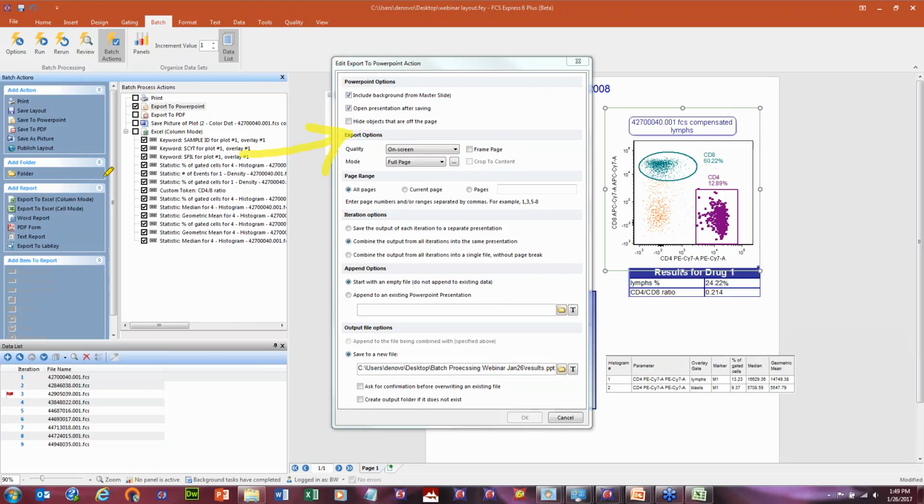And that'll sort of compress the results for you visually, help you save paper, whatever you're trying to do. All right. So the tiling options are here under export options. So before I actually run the tiling options, let me explain to you the options that are available to you. So under mode, there's this drop-down menu. And like I said earlier, this is basically analogous to printing multiple pages per page on a printer.